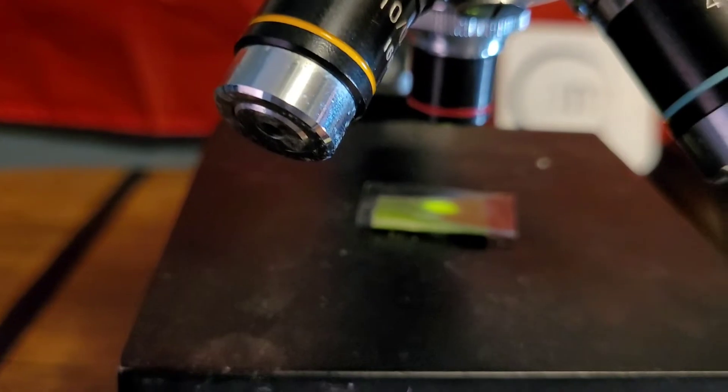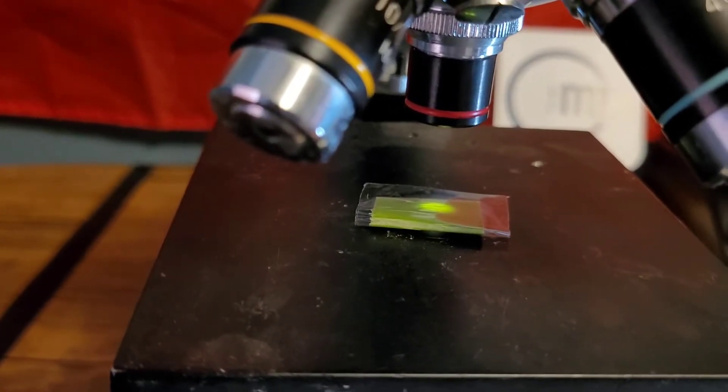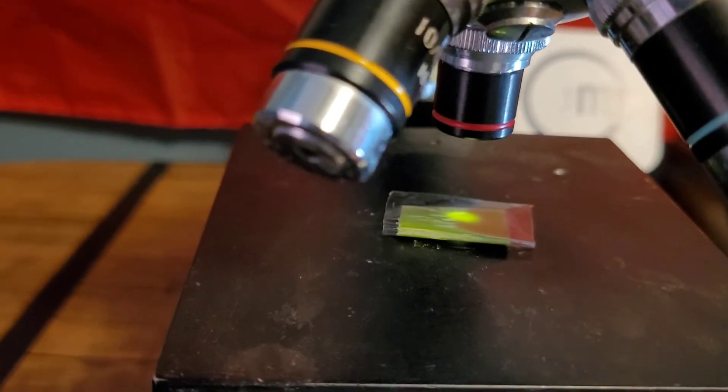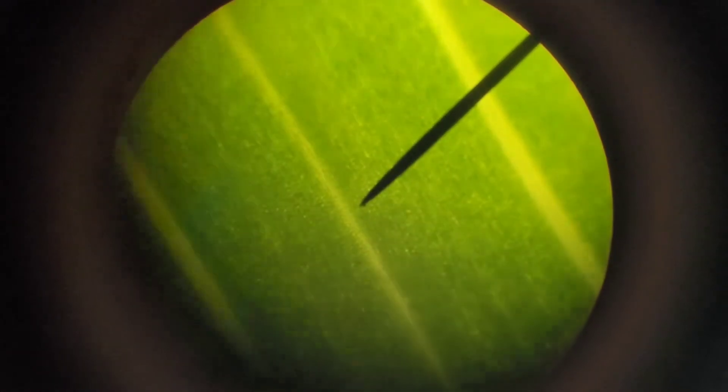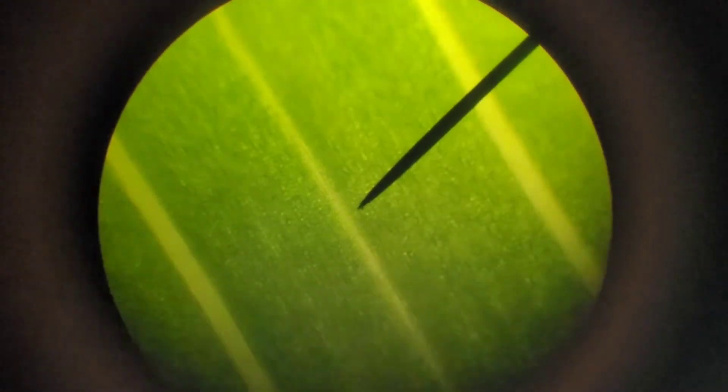It was off of like a plant with like a reed. So let's look at this now. This one's pretty simple. It's just a bunch of reeds in a straight line. There's nothing really interesting about this one. You can see all the fibers, but that's about it, that's the only thing kind of cool.